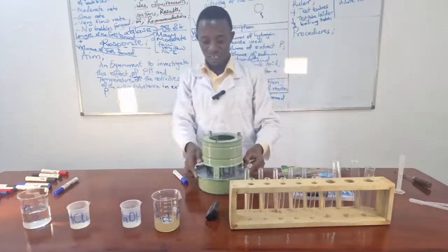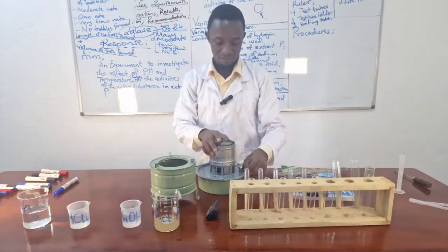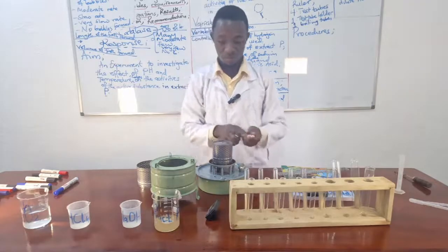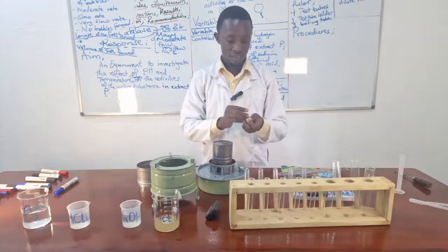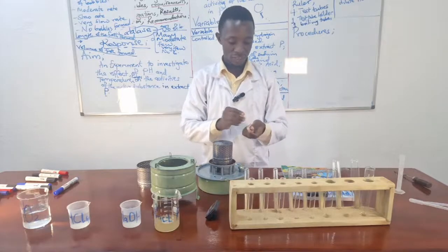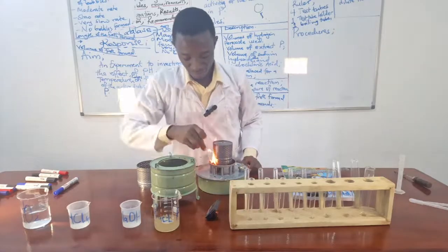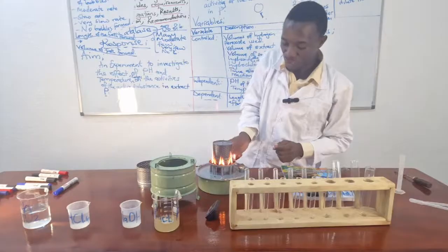For us, we use this. I'm going to light it up. I'm going to boil part of the extract. I don't want us to say that we got things from heaven.